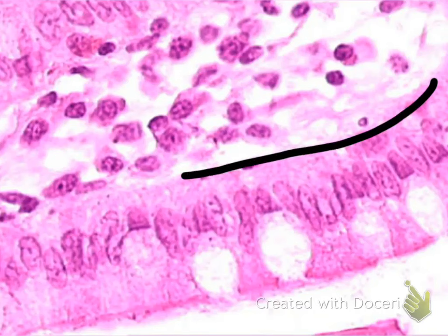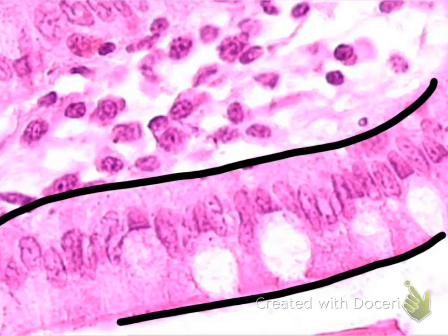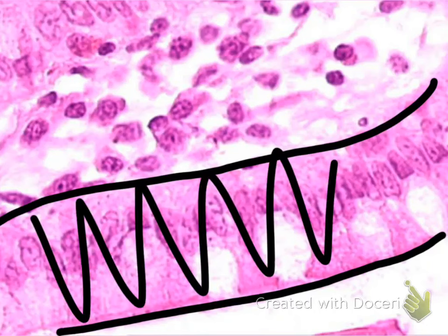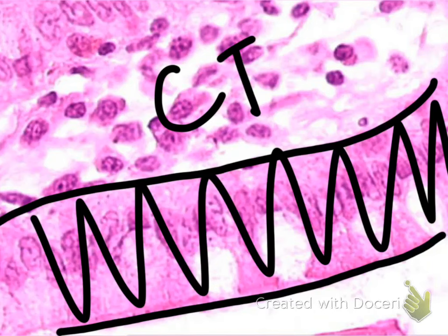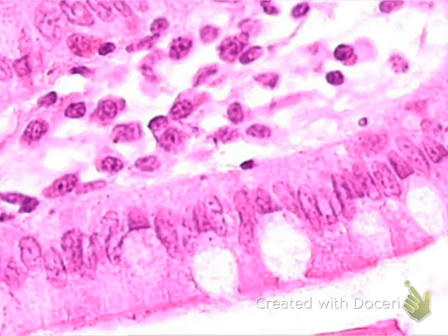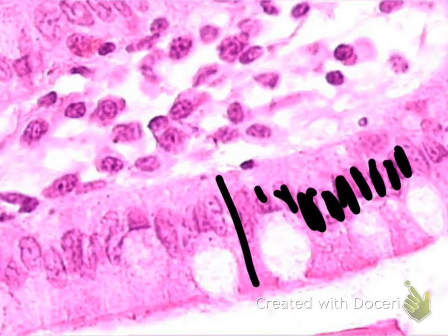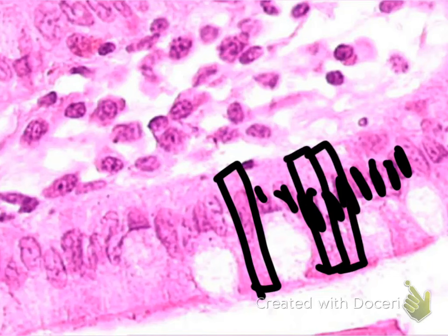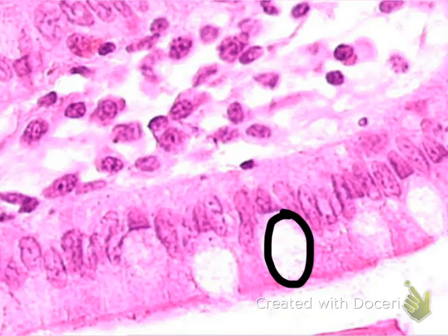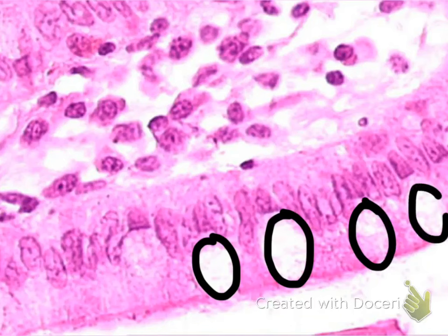Basement membrane connecting the epithelium to the connective tissue. Your apical surface is not attached to anything, so this here is your epithelial tissue and this is your connective tissue. Notice that the shape of the nuclei are tall and lined up toward the basement membrane, which means the shape of the cell is rectangular. One row of rectangular shaped cells — this is your simple columnar. These white structures, because we're looking at a columnar cell, are your goblet cells, which produce mucus.